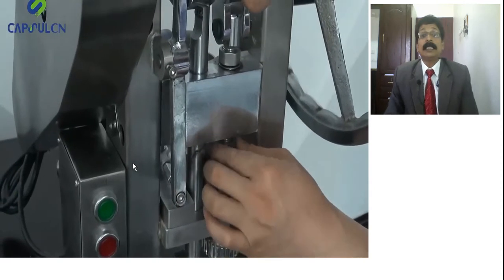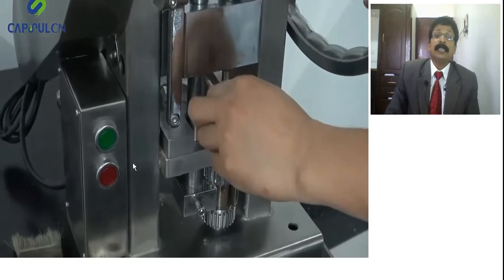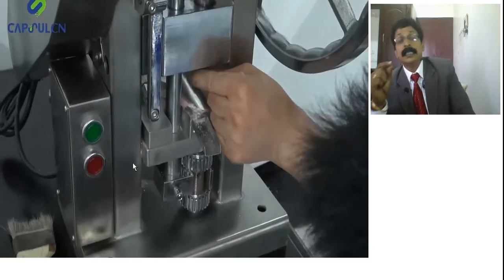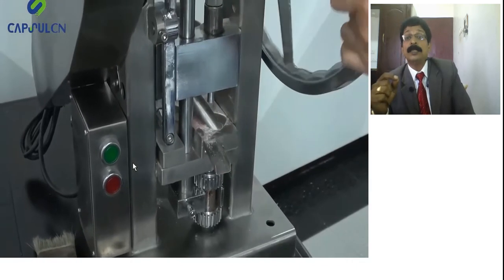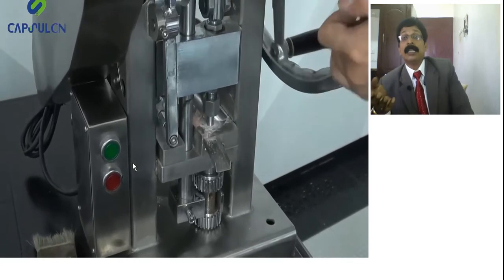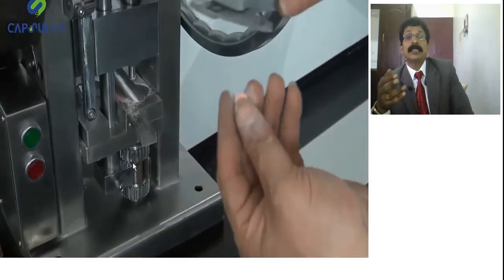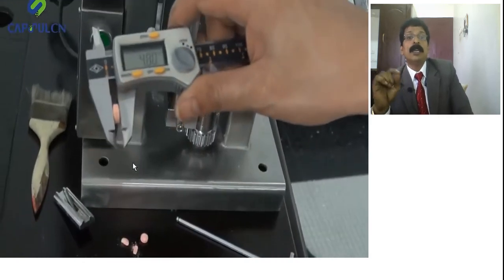Again he will check the tablet hardness by means of what we have seen in the in-process checking. See, there is the tablet, and he is checking the thickness of the tablet with the vernier caliper. Hardness will be checked, and even the friability test will be checked, and in process they also check the content test. Only then can you go to the next step. When it is confirmed, you check the thickness of the tablet, and it is up to the mark which they want.